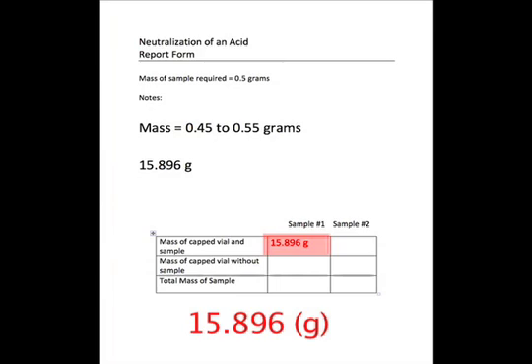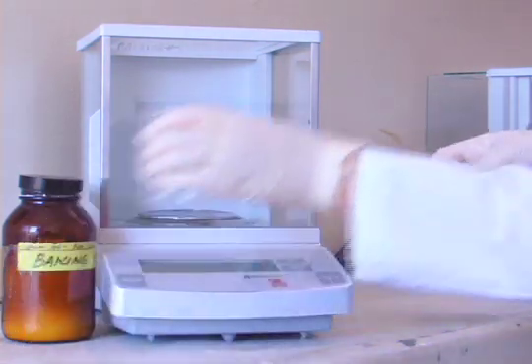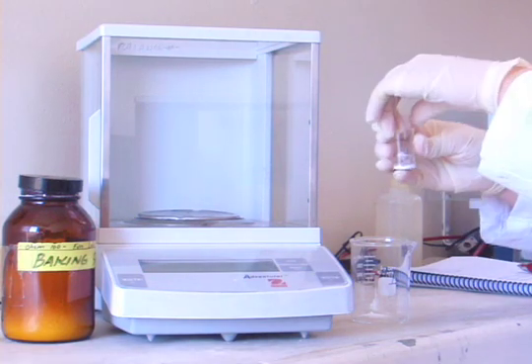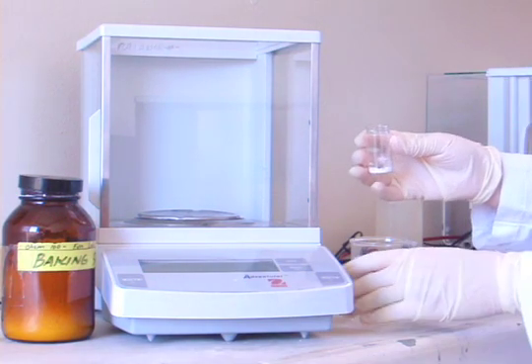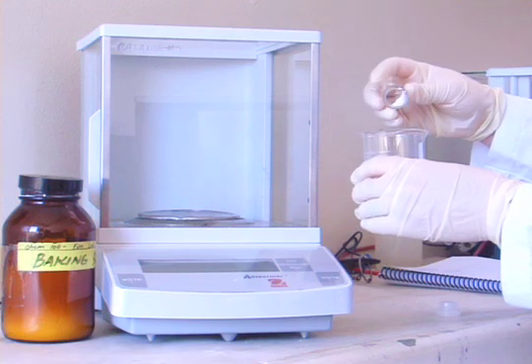Remove the vial from the scale and sprinkle a small amount of the solid, approximately one-half of your sample, by slowly rotating the vial, allowing the solid to fall into the number one beaker.